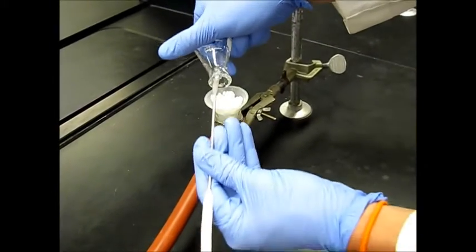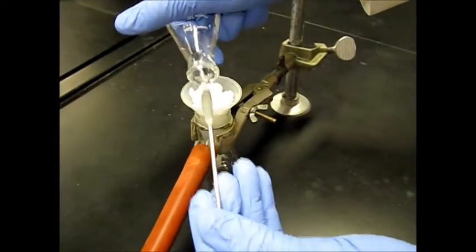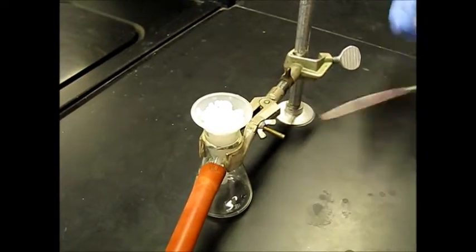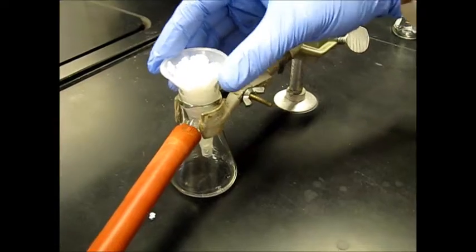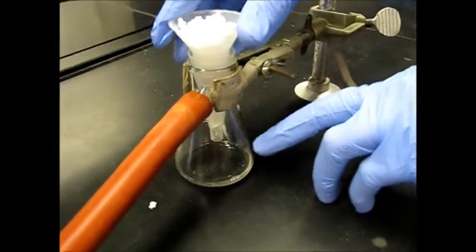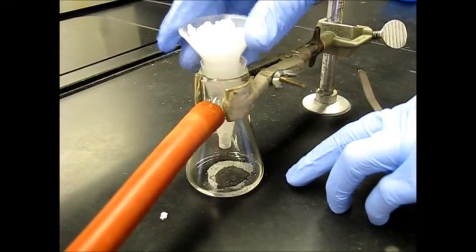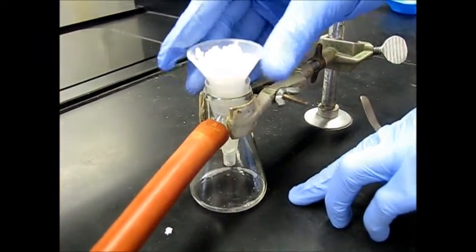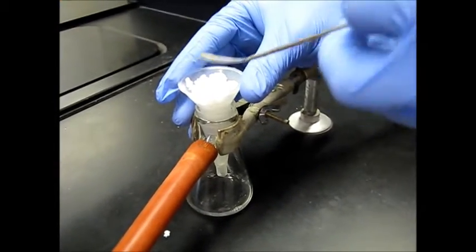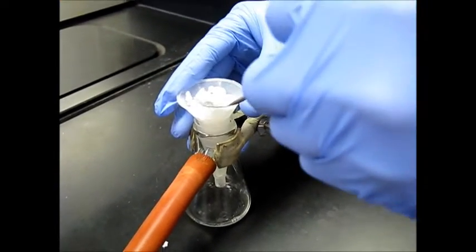Alright, so we're getting the last little bits out of the Erlenmeyer flask here. Cool. So we're going to go ahead and allow this vacuum to kind of suck dry. You push down, you'll notice that we actually get some liquid out. See there? So that just helps the suction be a little bit stronger. We're going to let it suck dry for about 2 or 3 minutes. It helps if you kind of press out the solid.